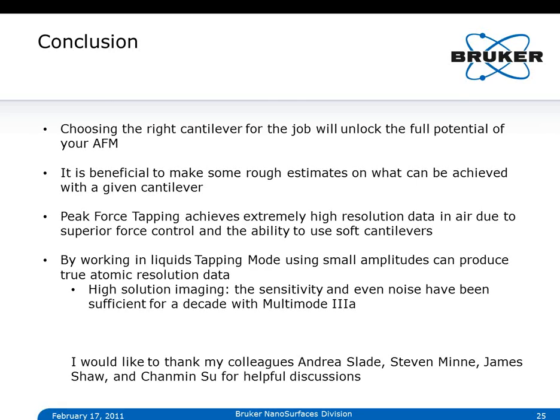That maybe is a good segue. There's a large group of questions focusing on the apex of the probe, and to group two of them together: what causes tip wear in tapping mode, and what probe should I use if I want to minimize tip wear?